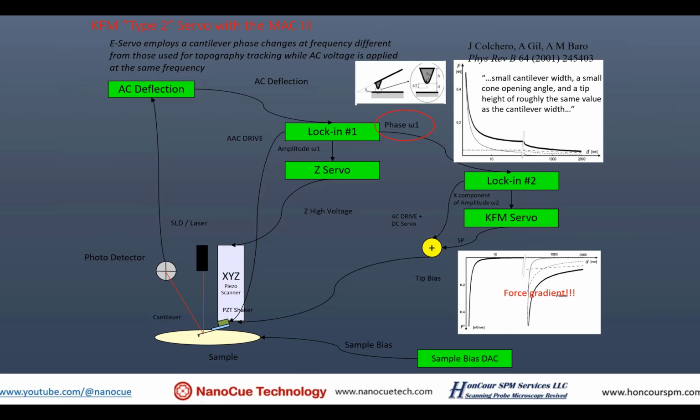at University in Dresden, but they were pushing FM-KFM using a PLL, and their whole scheme ended up bypassing the PLL and just pulling out the phase detection signal from their PLL and using that as the input to their lock-ins.